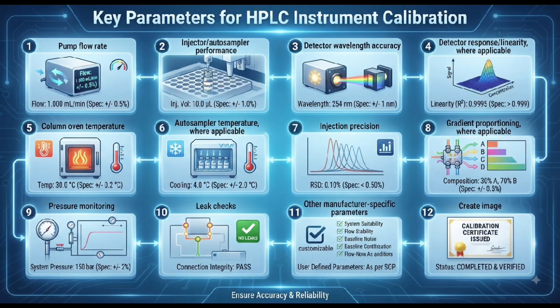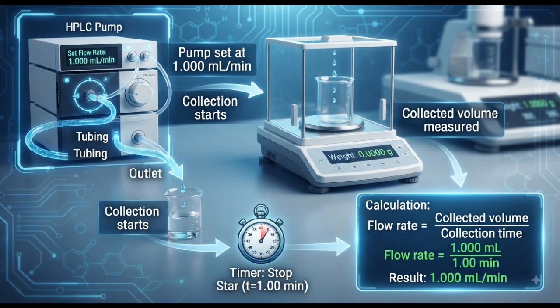It is very important to remember that there is no single universal HPLC calibration checklist applicable to every HPLC model. The calibration procedure should always be based on the approved SOP, manufacturer recommendation, applicable pharmacopoeial or regulatory requirements, and the laboratory qualification strategy.